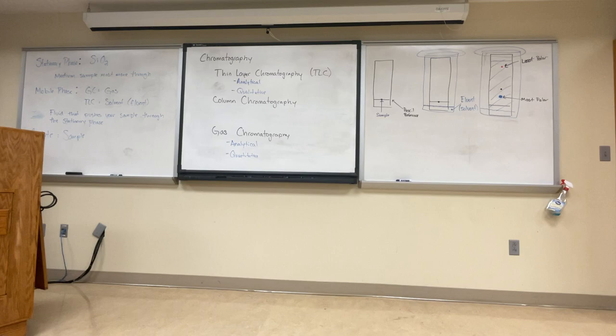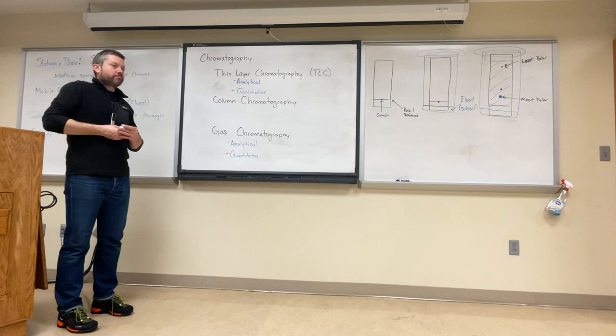You can change these, right? Like I said, you can change the stationary phase, you can have different materials, you can change the mobile phase. In gas chromatography, it's gas; in TLC, you can use all sorts of different solvents, but it works all the same.